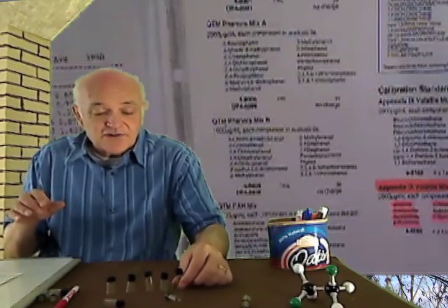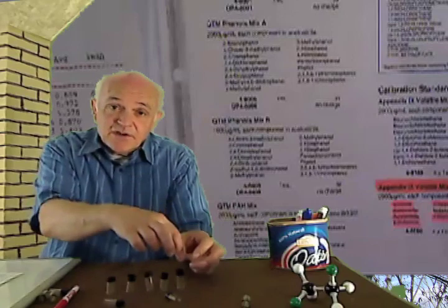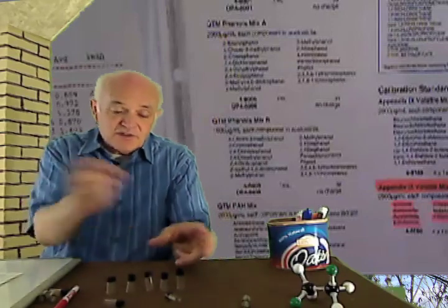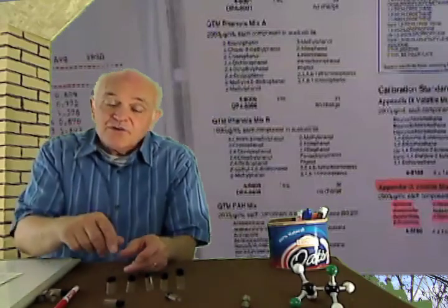So the vials are broken off and transferred into the appropriate vial. The first one's broken off, transferred. Second one's broken off, transferred. Third one's broken off, transferred. Fourth one's broken off, transferred. Fifth one's broken off, transferred. It has to be done such that they don't get contaminated.